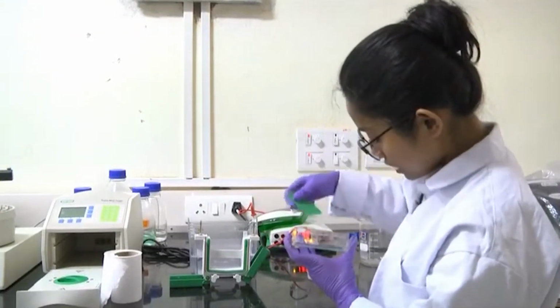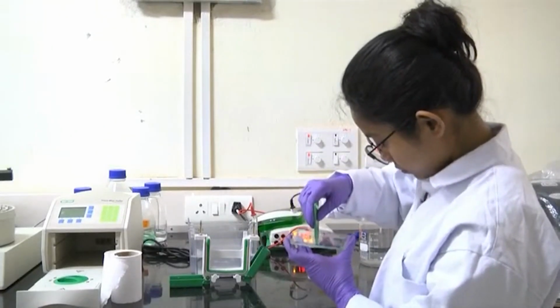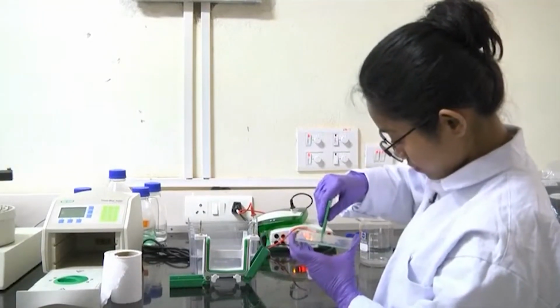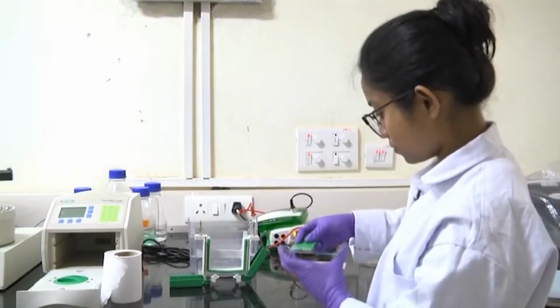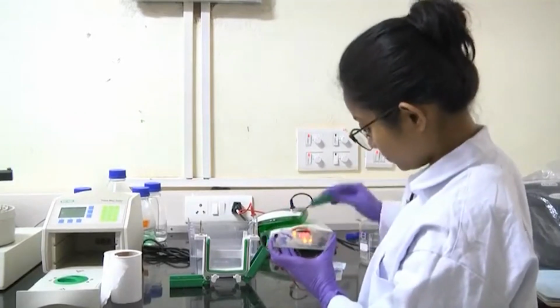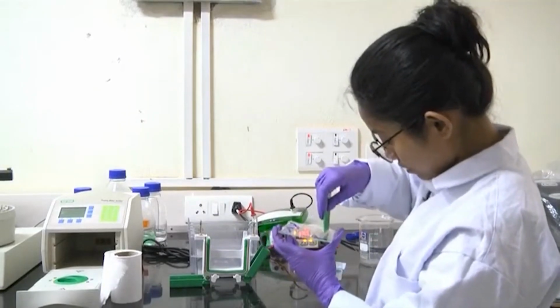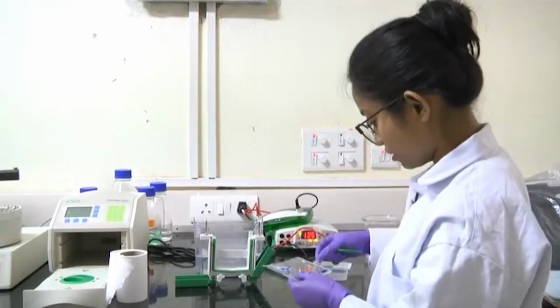I don't need the whole gel, so I will just cut the gel using this cutter. This we will discard. I will keep the ladder, because that will tell me, when the transfer is done, if the proteins are transferred properly or not.